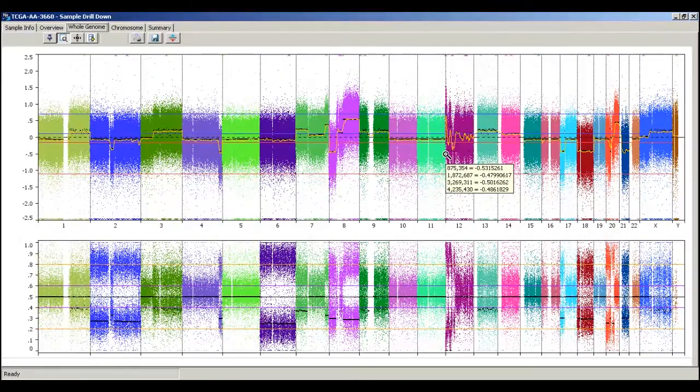And in case you don't already know, chromothripsis has been recently described in a number of cancer papers, and it's basically chromosomal shattering. So the chromosome is broken apart into many, many pieces, and then it's reassembled sort of haphazardly so that you end up with large regions of non-consecutive loss, basically areas that don't get rejoined into this new chromosome. And one of the hallmarks of this feature is this aberrant gain-loss copy number calling, and also aberrant allele calling, and you can see the allele calls also look pretty strange here.